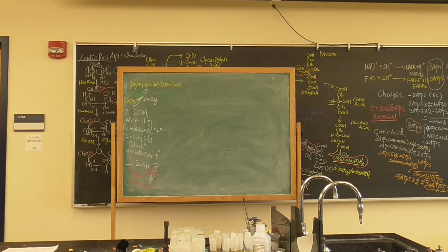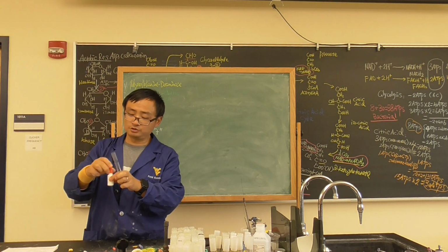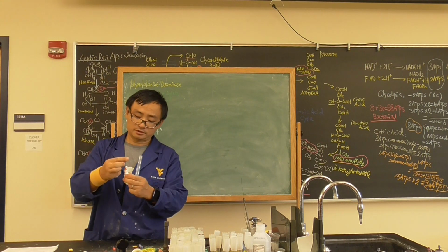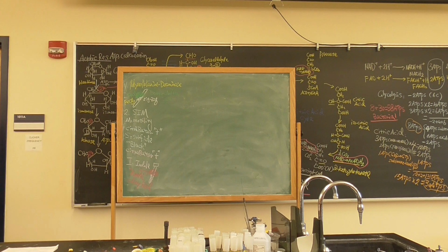Let's see. Who has Citrobacter? Let's look at Citrobacter. I usually don't do this test, but I will just show it. Okay, everybody look at this. Bacteria goes everywhere, so motility positive, black color, sulfide positive. Let's see the indole. Usually indole shouldn't be positive for this one. Oh, sorry, it's the wrong reagent, because it's a Kovac bottle, but inside is methyl red. That's why it felt weird.